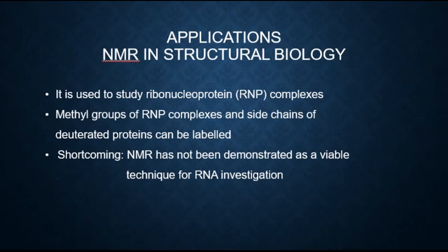Structural biology is another scientific discipline where NMR can be applied. The analytical technique is used when studying ribonucleoprotein, or RNP for short, complexes. NMR was only considered useful for smaller proteins in the past, but after the technology of the instrumentation has evolved, NMR has been proven to be useful for elucidating the structures of high molecular weight RNP complexes.